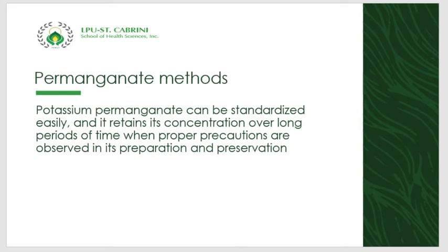So now, we will be going with your permanganate methods. Potassium permanganate can be standardized easily and it retains its concentration over long periods of time when proper precautions are observed in its preparation and preservation.